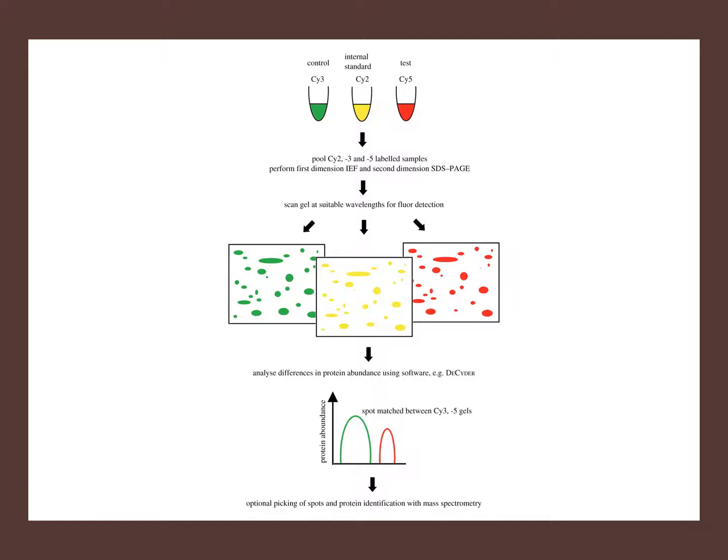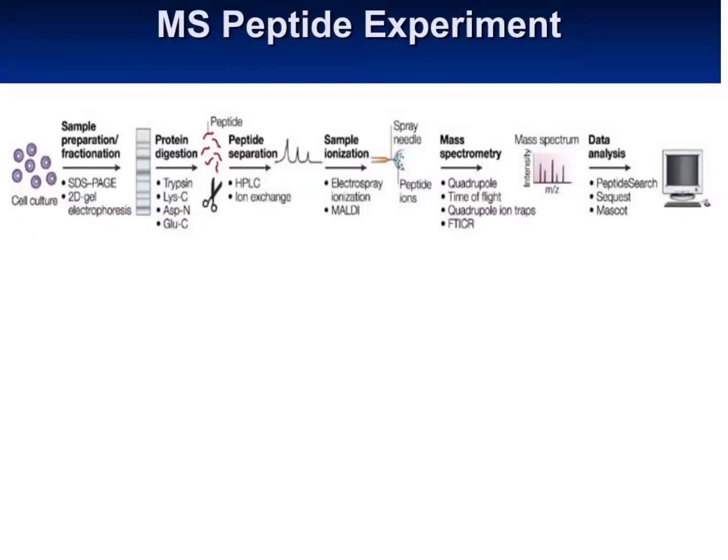And we do a 2D gel, and we then look in 3 channels and compare the differences here, and look at the different spots and what's different, what's in common, and then you could figure out, like I said, each spot could be excised and the fingerprint determined there.